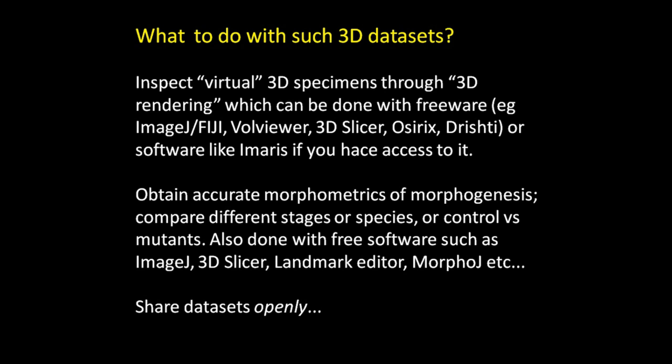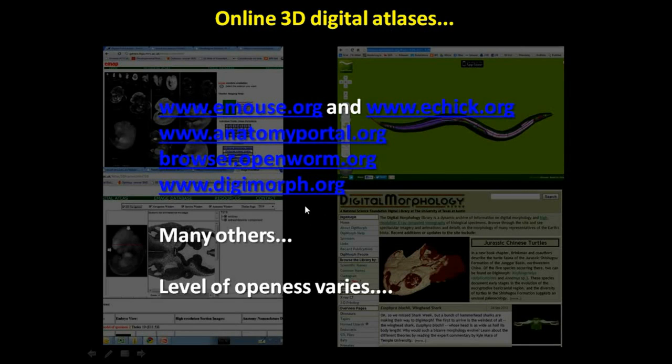You can actually share them. And there have been many very good examples of projects where people created the conditions to share digital atlases online, digital information or 2D data sets. But probably the longest and best known example is the Mouse Atlas project that originated in the UK, in fact in the place where OPenT was developed.